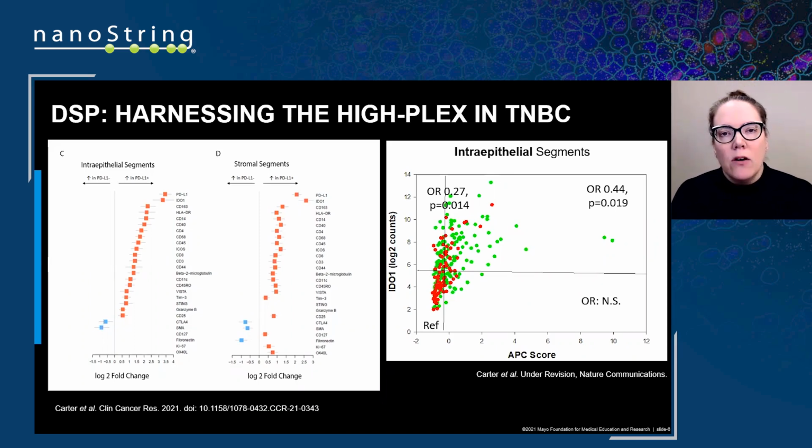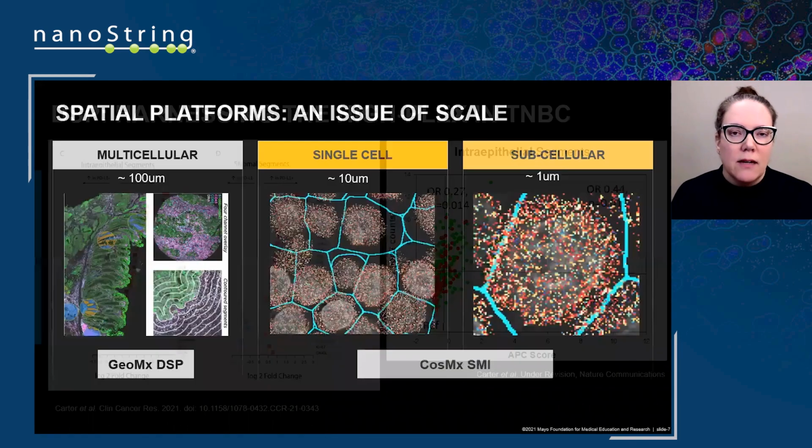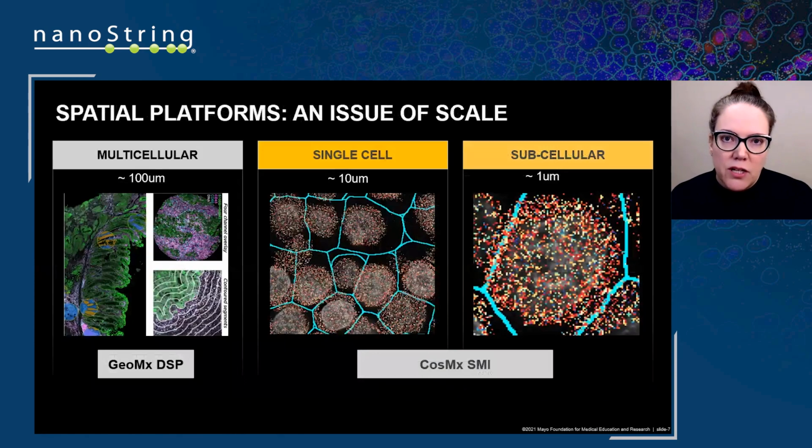Now, this pairing of the modules with individual proteins was true for some targets like PD-L1, but that was not true when we looked at others, which seemed to be not only spatially agnostic, but also agnostic with relationship to these functional modules. So very intriguing data, but of course, always we're trying to push the envelope and go after higher resolution single cell.